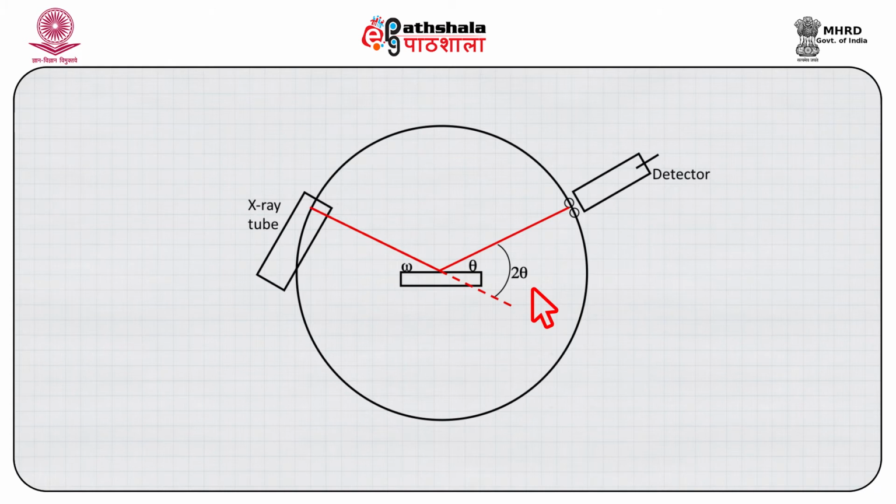The goniometer keeps track of the angle theta, while the detector records the rate of X-ray coming out the other side of the sample in units of counts per second. The X-ray intensity then can be plotted against the angle theta or 2 theta, whatever the case be, to produce a graph, and this allows us to note down specific d-spacing or constructive interference situations satisfying Bragg's law.